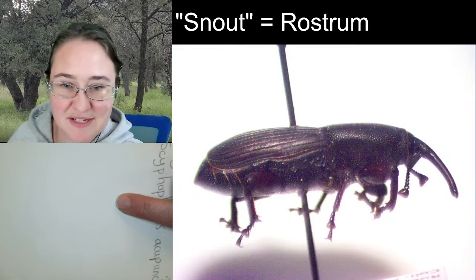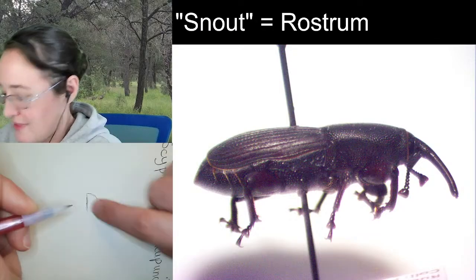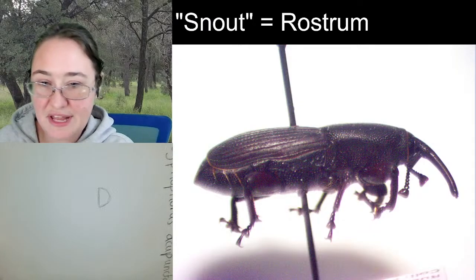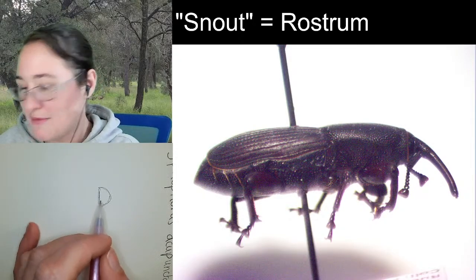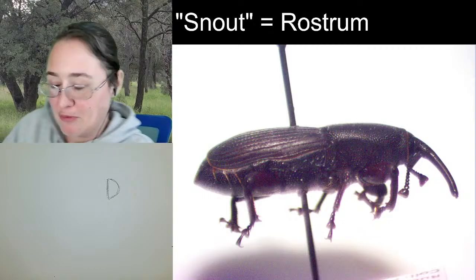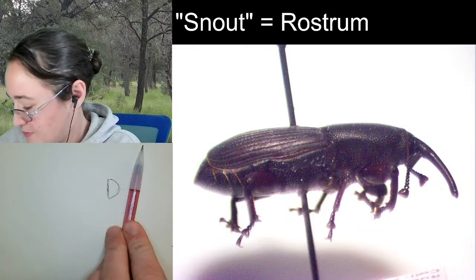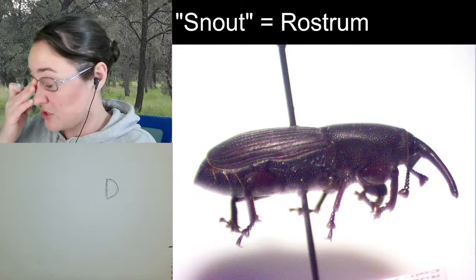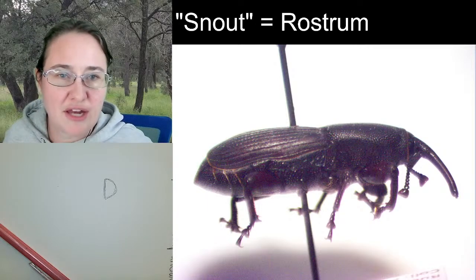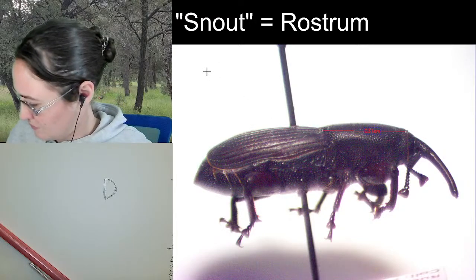So I am starting my sketch with kind of this narrow D shape. I'm going to avoid drawing that snout just yet, and I just want to start with the outline of this head here, really nice and light, and from there, instead of drawing the snout, I'm going to go back and draw the body first and then come back to the snout so that I have a little bit more to compare it against. So we mentioned from the front of the head to the back of the abdomen, the specimen is 1.41 centimeters long. I could even give us the measurement. Might as well, right? 2.5.